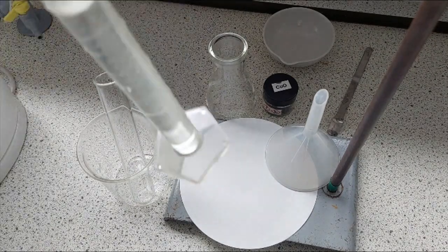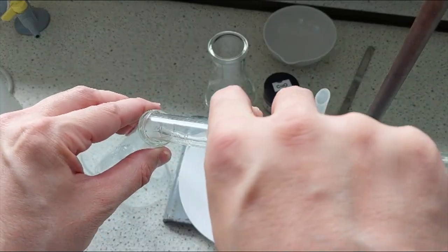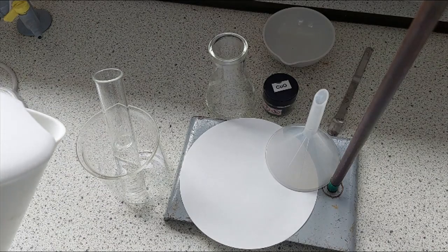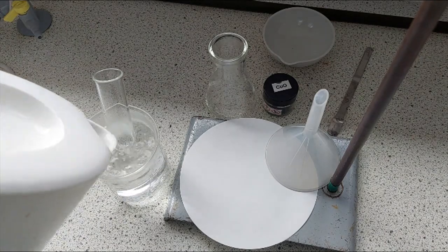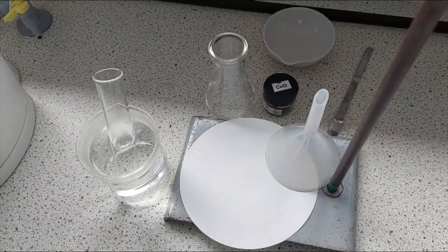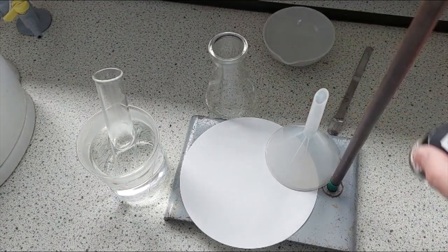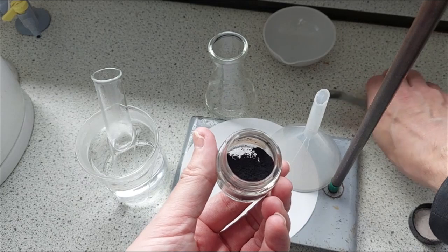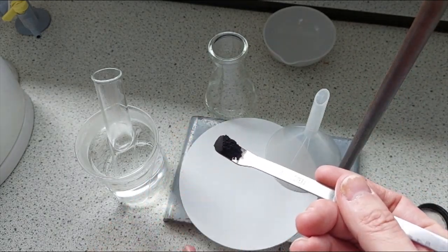The first thing I'm going to do is take my sulfuric acid, which I've just measured out, and pour it into my boiling tube. I am then going to place the freshly boiled water into the beaker to form our water bath. That's going to start to raise the temperature of the sulfuric acid. Obviously taking care not to get that on my skin. I'm not going to handle the beaker at the moment because it's going to be quite hot. What we'll do next is we'll take our copper oxide. You'll notice it is a black powder, and I'm going to add this to my sulfuric acid.